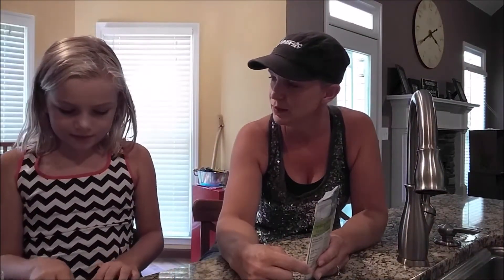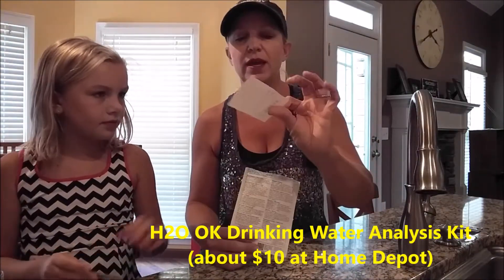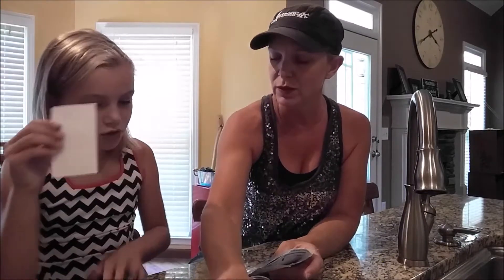How are you able to tell the different sizes? Why the different sizes of the testing kit? Well, if you look on the back of these, this kit comes with one of these little things where you're going to compare the colors to what you test in your water sample, which is going to go in here.